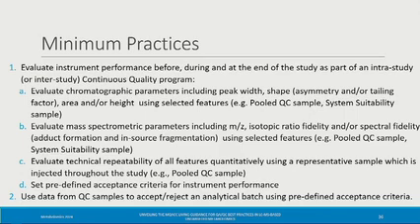You might need to go to a new collection. If you know that you're looking at metabolites that are stable to freeze and thaw, then you might be able to rerun it. So it's really going to be study dependent. I can't generalize, because sample and study type are going to dictate that. Thanks.